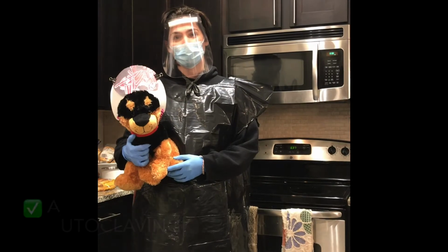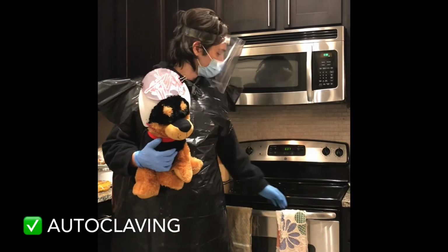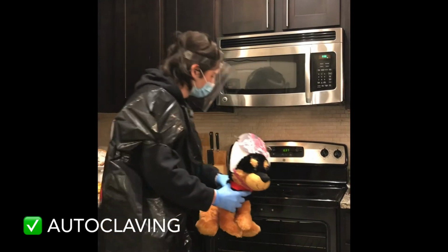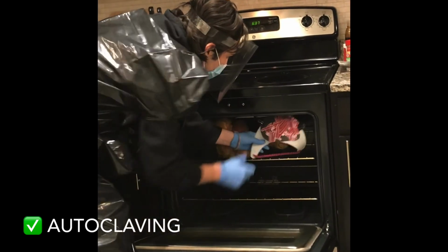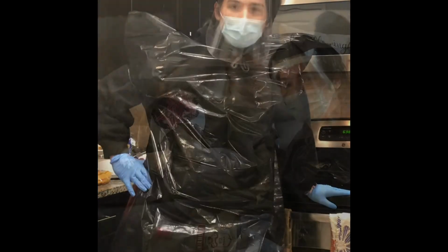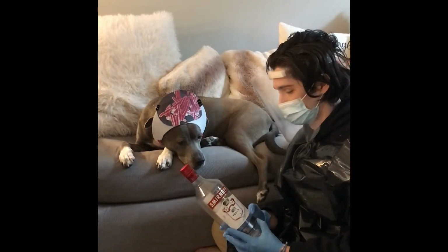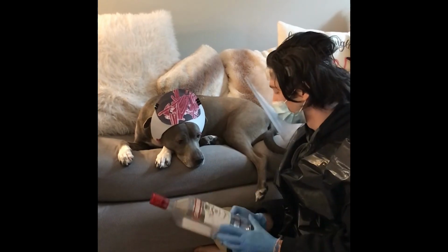The autoclave is a chamber which is filled with hot steam under pressure. It's a preferred method of sterilization unless any material is damaged by heat, moisture, or high pressure. Alcohol is another great chemical disinfectant to get that bacterium under control.